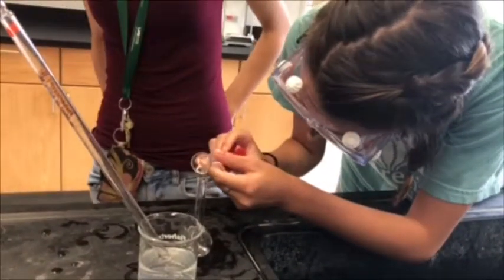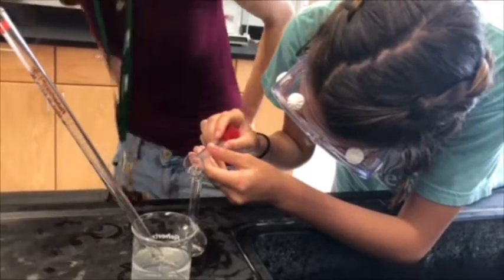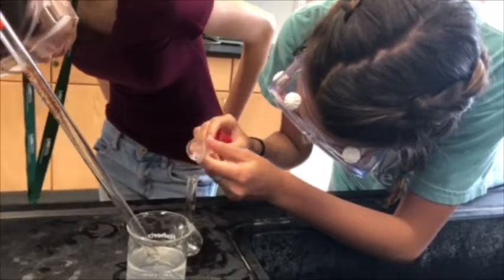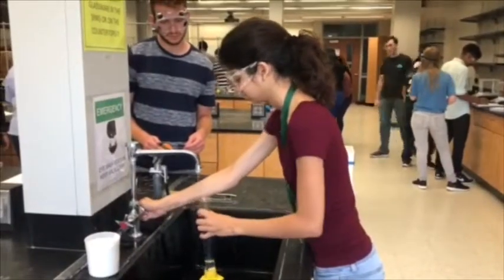By subtracting the final volume from the initial volume, we were able to find the volume of the stock solution present in the flask. We then filled the rest of the 25 milliliter flask with water to dilute the solution.